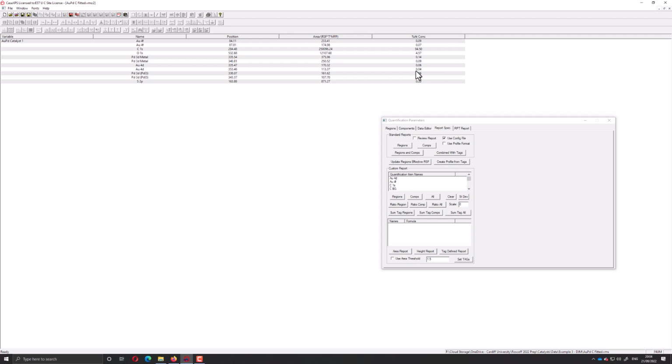Now that might say that our background modelling is incorrect, and indeed it could be right. That may be the case.